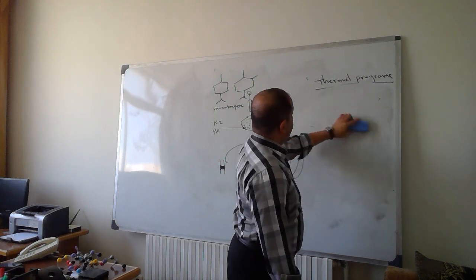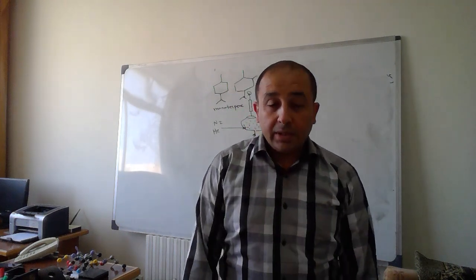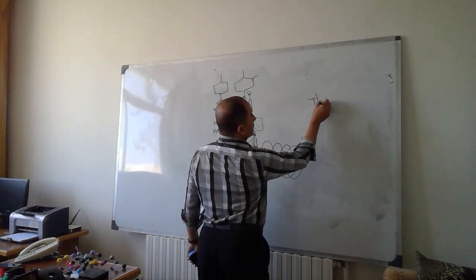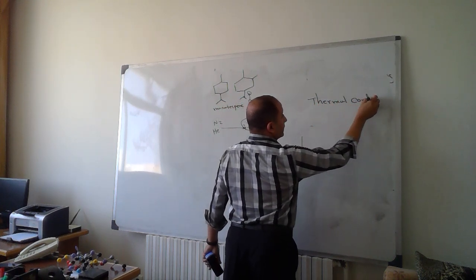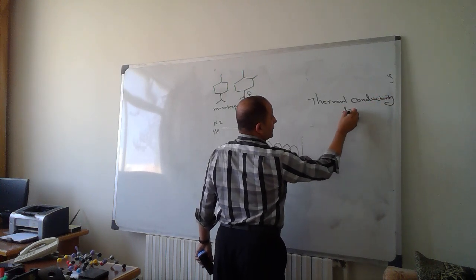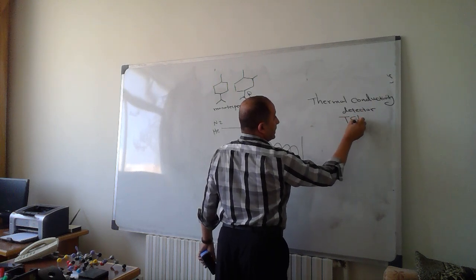One of the oldest detectors is the thermal conductivity detector. It has the abbreviation TCD.